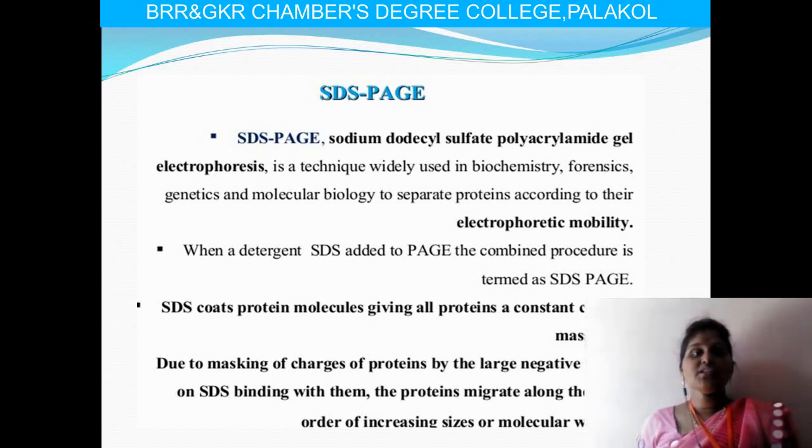It is widely used in different laboratories like biotechnology, biochemistry and molecular biology laboratories for the separation of different proteins. When the anionic detergent SDS is added to PAGE, the combined procedure is termed SDS-PAGE. Due to the masking of the charges of proteins by the large negative charge of SDS binding with them, the proteins migrate along the gel in order of size. So based upon size, the molecules will move in this gel.